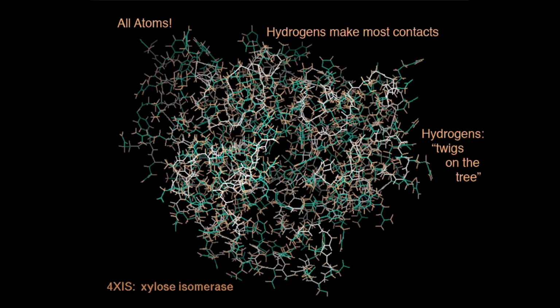And most of them can be added very reproducibly from the heavy atoms. And our program REDUCE, that's been mentioned before, works very hard at trying to get the ones that are rotatable correct. We look at entire H-bond networks and optimize the whole networks. Again, nothing like that is ever perfect, but it's very good.